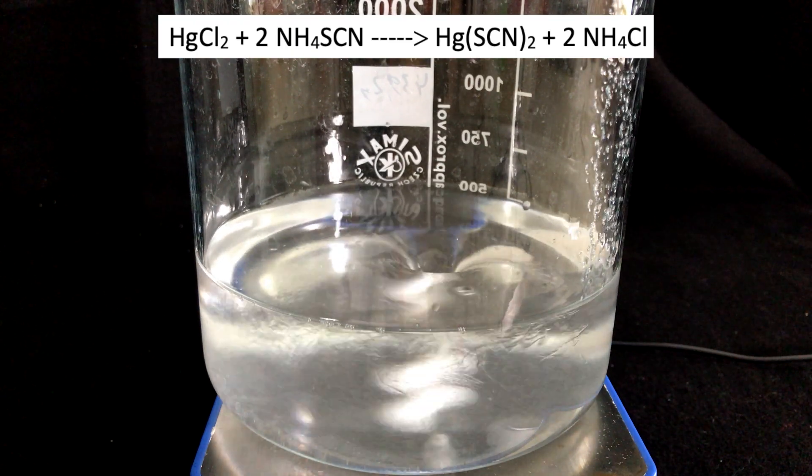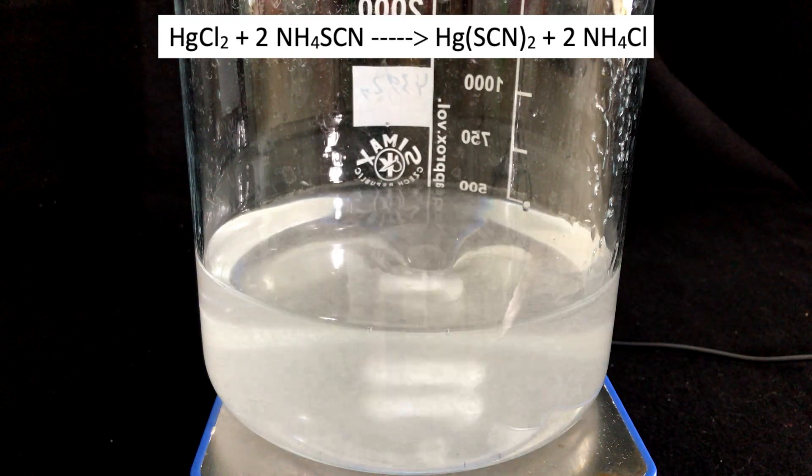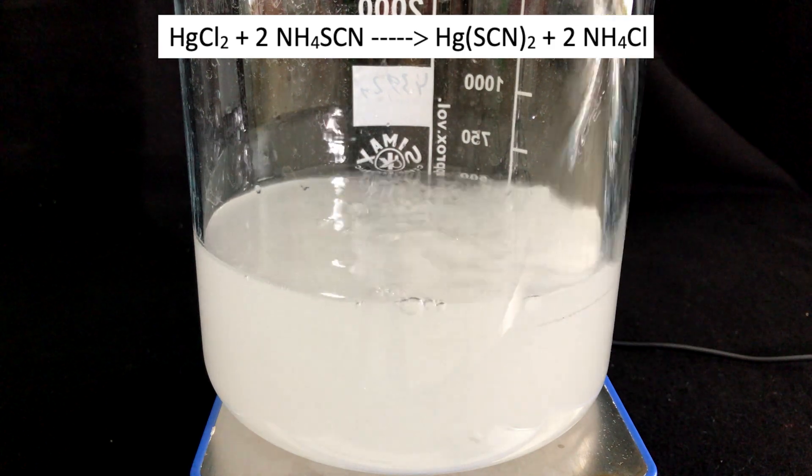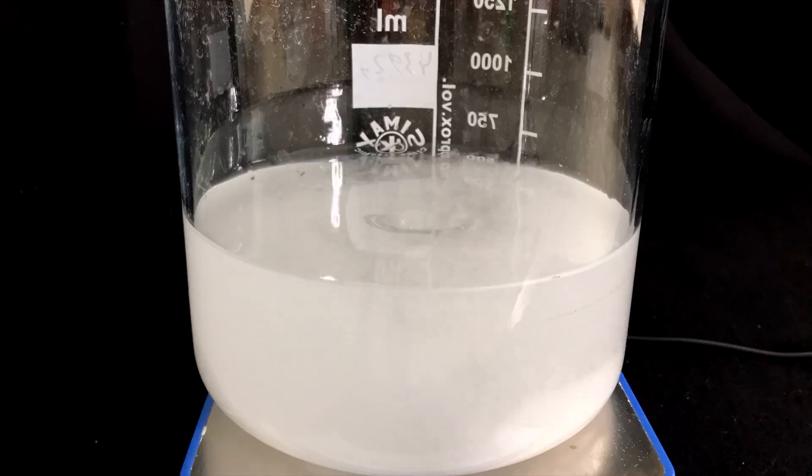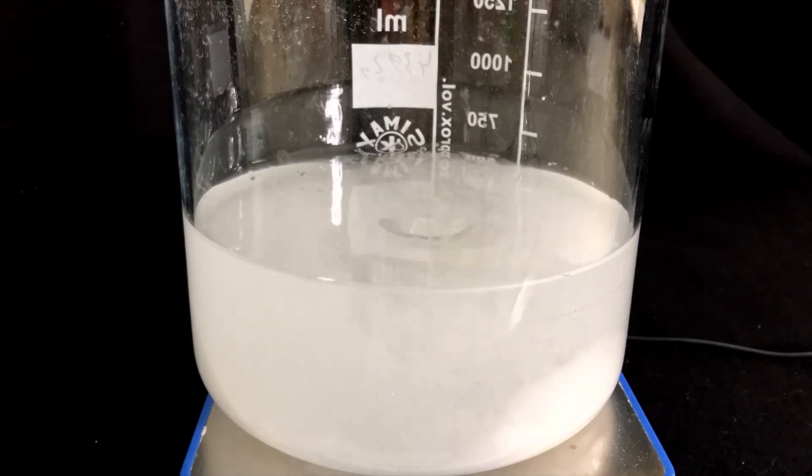Anyways, this doesn't matter. Let's come to the reaction. Mercuric chloride reacts with ammonium thiocyanate to form mercury thiocyanate and ammonium chloride. After some time, the mercury thiocyanate fortunately decided to crash out.